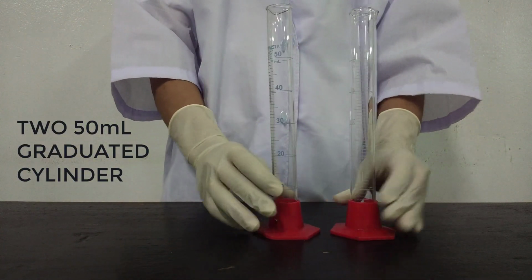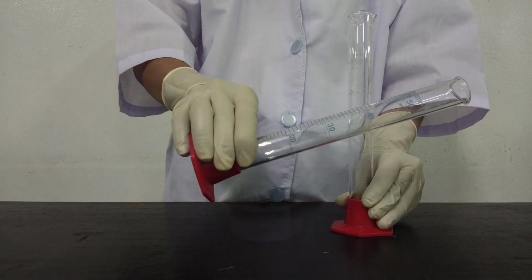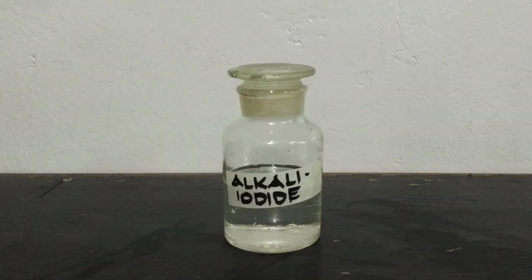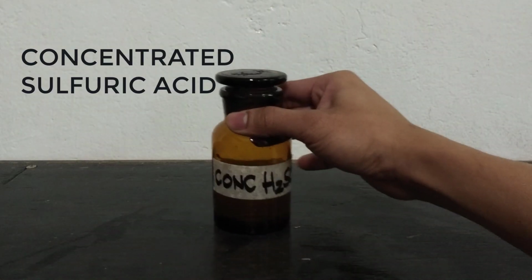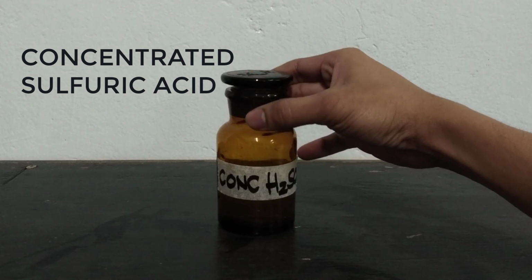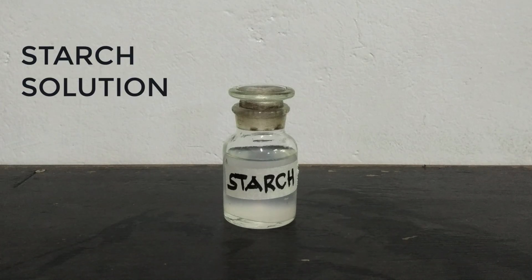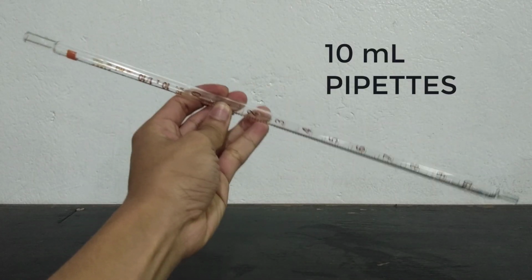2 50 ml graduated cylinders, or we can use 1 100 ml graduated cylinder. Manganese sulfate, alkali iodide solution, concentrated sulfuric acid, starch solution, 10 ml pipettes.